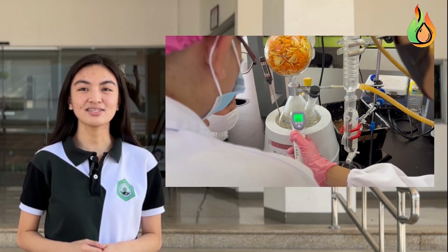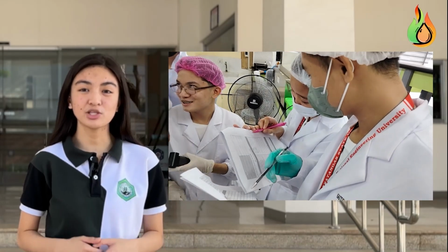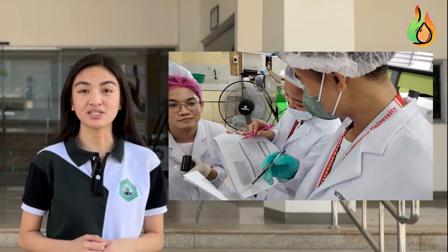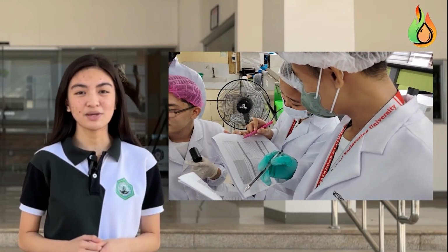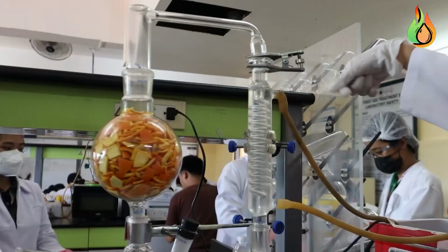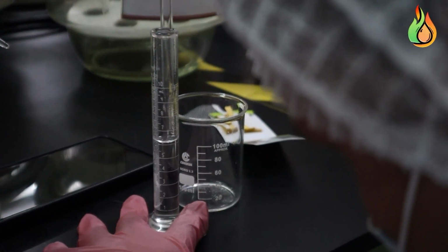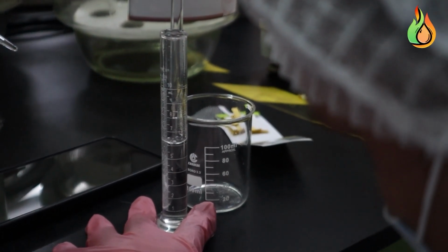This discrepancy is likely due to the infrared thermometer measuring the surface temperature of the distillation apparatus or liquid mixture, rather than the actual vapor temperature, leading to an underestimation of the dew point. Understanding these points is crucial for optimizing distillation conditions, ensuring maximum yield while preserving its aromatic and therapeutic properties.